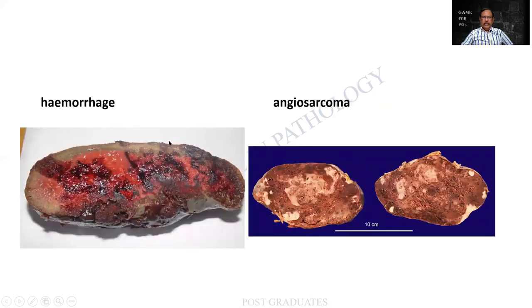And look at the hemorrhage over here. You find that there are dark areas of recent hemorrhage, and it is showing some kind of a degenerative change also. Whereas in this, it is again irregular vascular. This can be an angiosarcoma. But be careful, these are all post-histology wisdom.